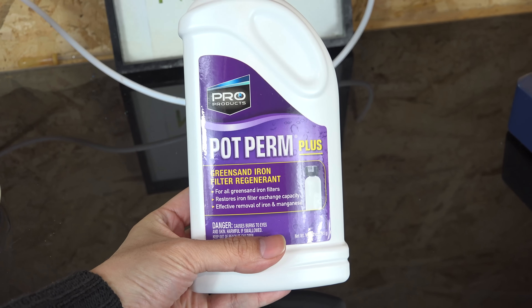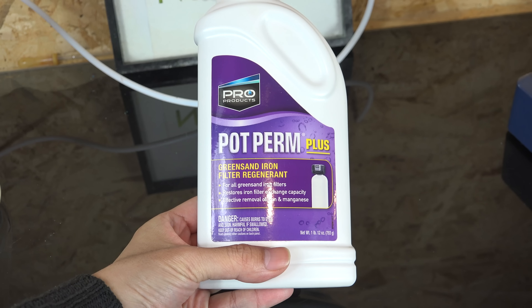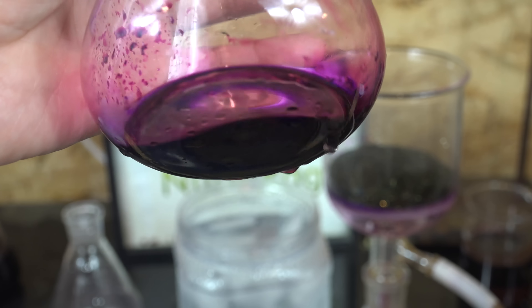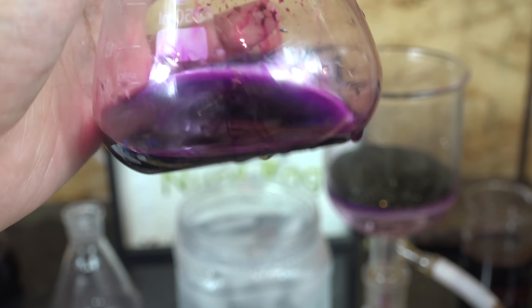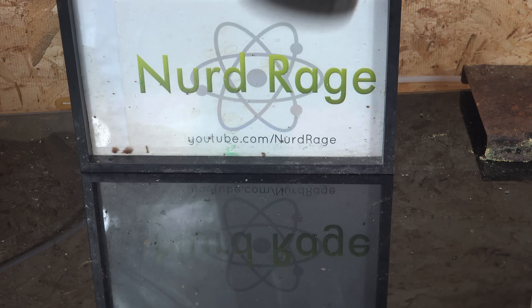For many amateurs it's not difficult to obtain; I personally buy it as green sand filter regenerant, so making it is not cheaper than buying it. It's more one of those trophy achievements for the amateur chemist because of its nice purple color, and it's quite rewarding to produce something so beautiful. As usual, our primary objective is to explore the science. So let's get started.